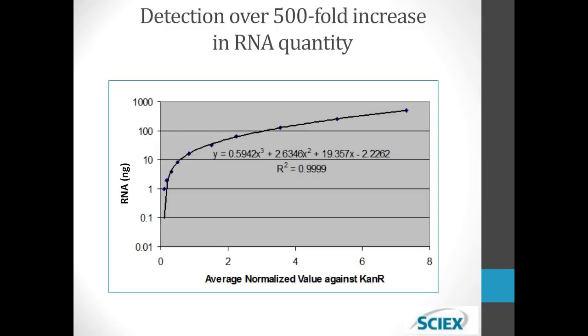However, there are some situations where increases in expression can reach 100 to 500-fold, for example, in immune-related genes. And an extended standard curve is required to accurately quantify this response. In this situation, standard curves follow a third-order polynomial. And so knowledge of the expected expression response for a particular suite of genes is certainly helpful to determine which of these standard curve approaches is most appropriate.